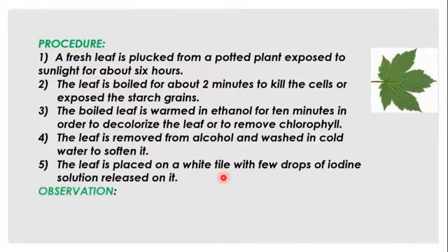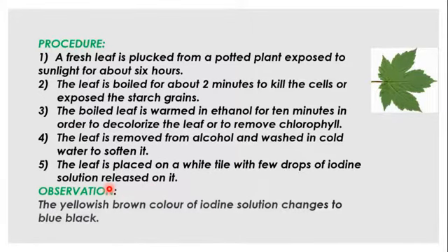Now, what will be the observation? Good. The yellowish brown color of iodine solution now changes to what? Blue-black. So the blue-black color of iodine shows that starch is present.